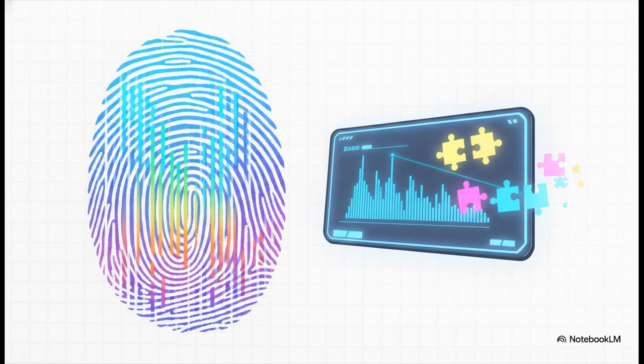When those successfully filtered ions finally strike the detector, they generate an electrical current. The computer system grabs all this data and creates a mass spectrum, basically a histogram plotting the abundance of the ions against their mass-to-charge ratio. Because every single type of molecule shatters in a very specific, repeatable way under that 70 electron-volt beam, this spectrum acts as an undeniable, unique molecular fingerprint. The computer simply cross-references this fingerprint against massive, detailed reference libraries, like NIST, matching ion ratios and spectral similarity scores to give us a definitive, slam-dunk compound identification.